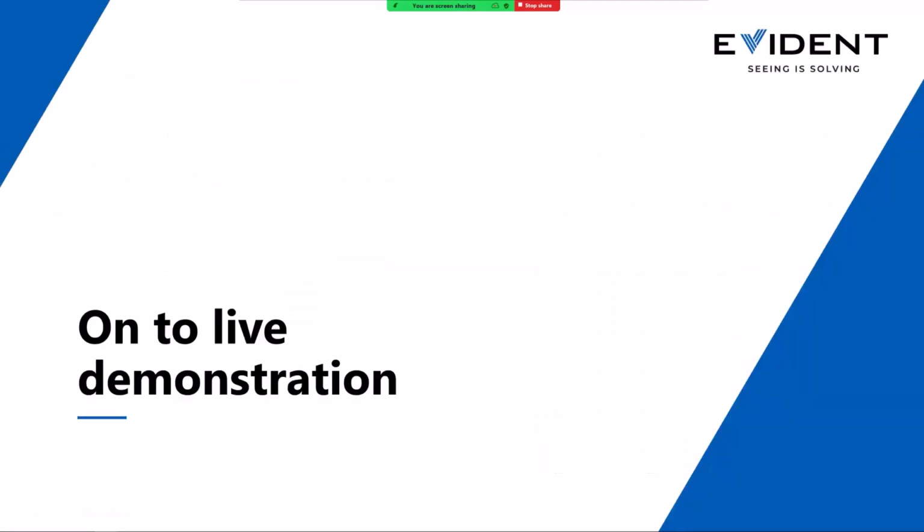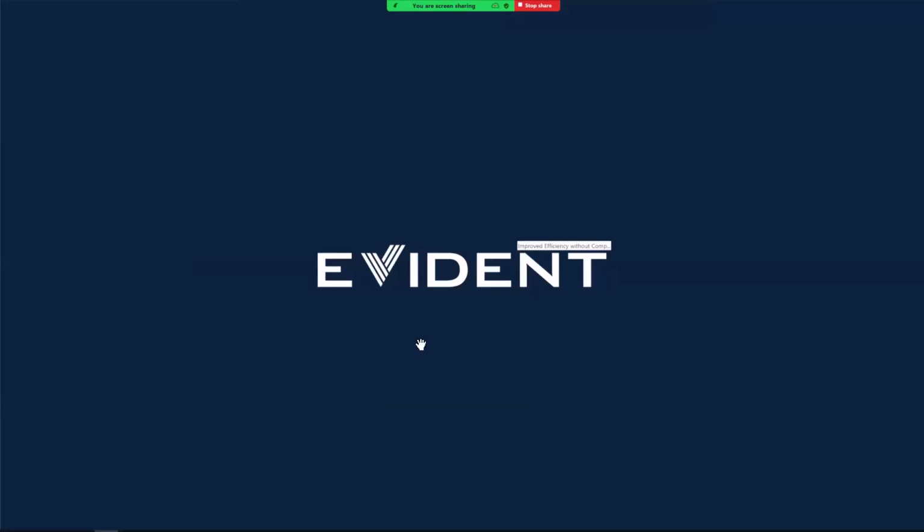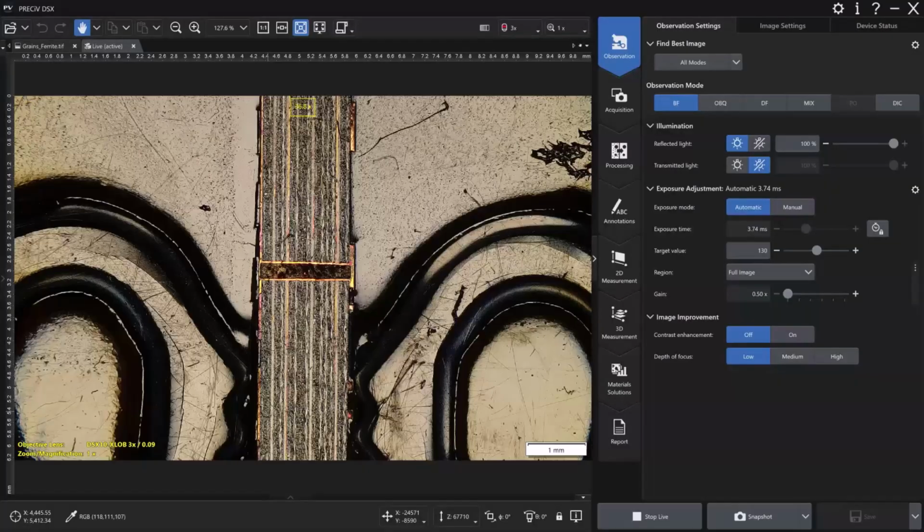So on to the live demonstration. My slideshow here. I have the PRECiV software running. And currently have a live image on the screen. This is the standard user interface as the software opens. It has a majority of the screen dedicated to either the live image or captured images.